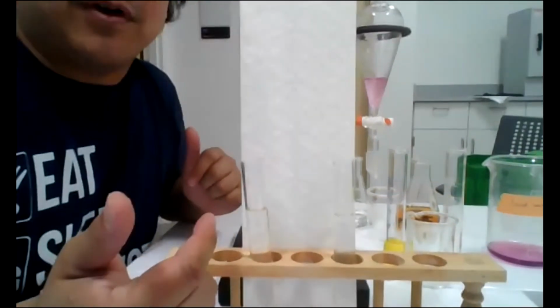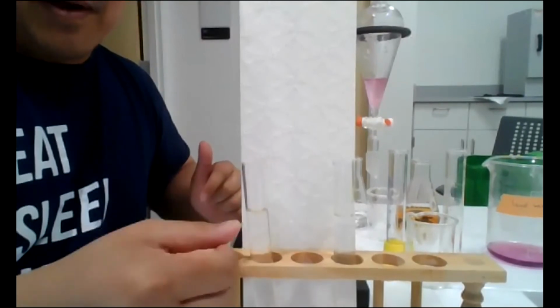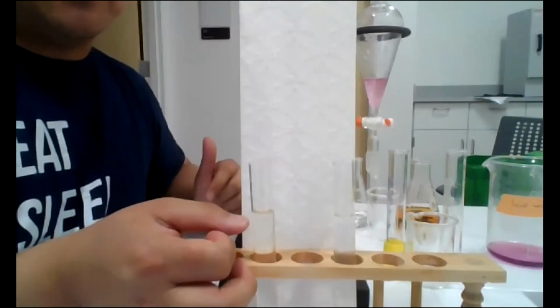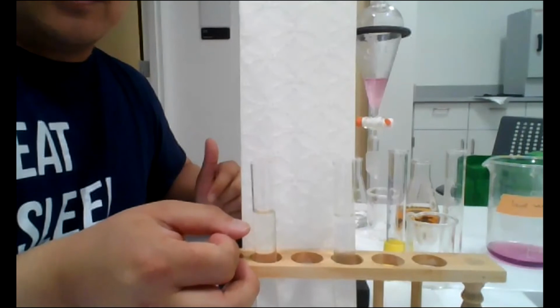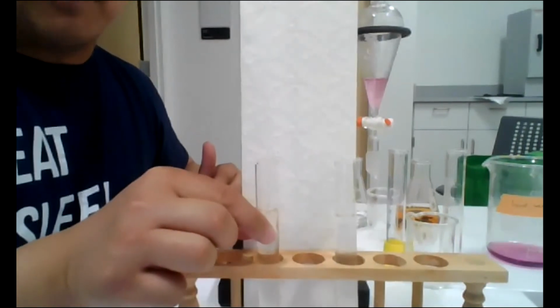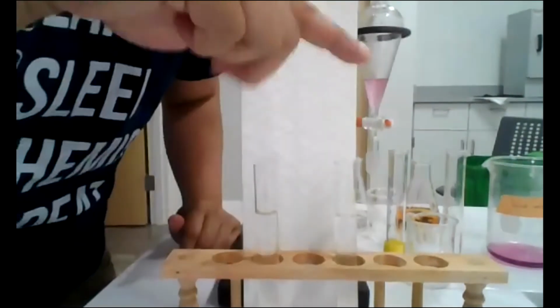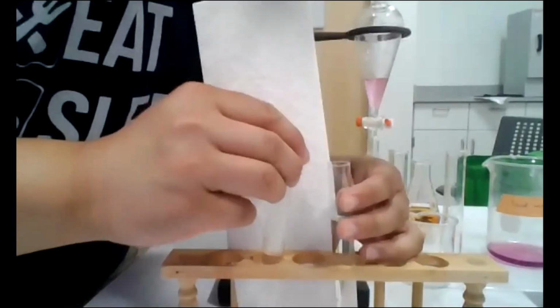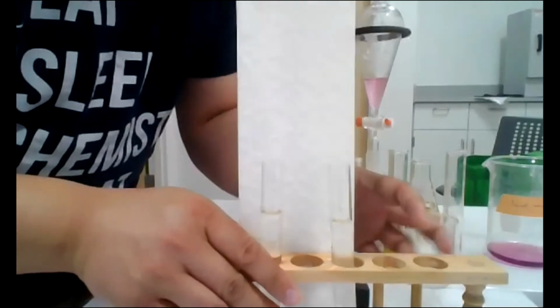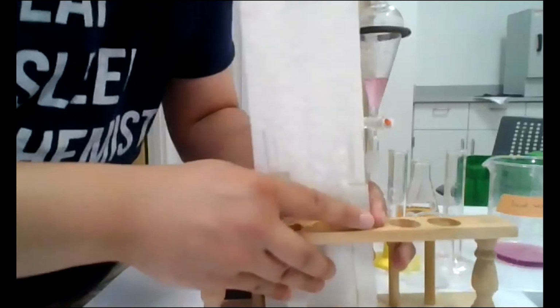Actually, this is not the best point of view because we're only looking through about a centimeter of solution. So what's a better way to look through most of the solution? Instead of looking through this direction, which is 1 centimeter, I can look from the top. So I can put my head up here and look down and see there's a difference. Okay, and I do see a difference. It's just that it's going to be very hard for me to show you because, obviously, if I tilt this, I'm going to spill it.